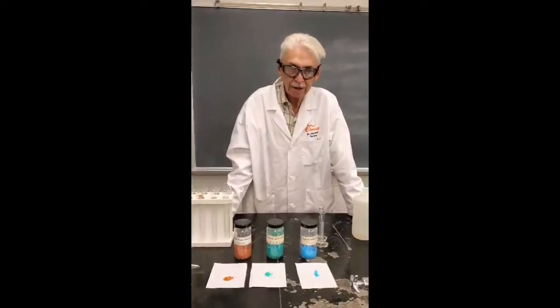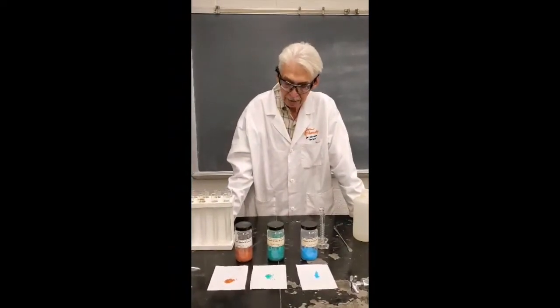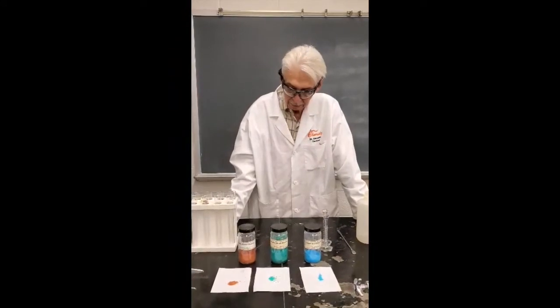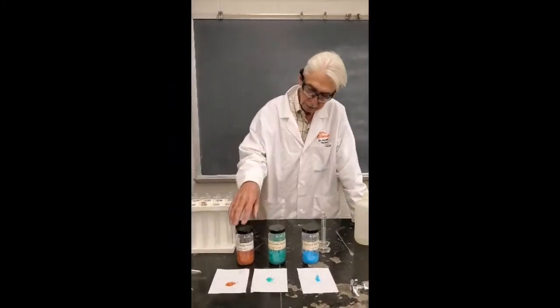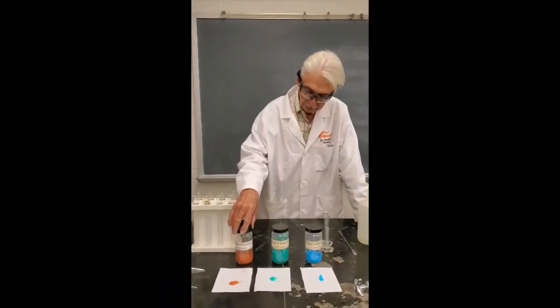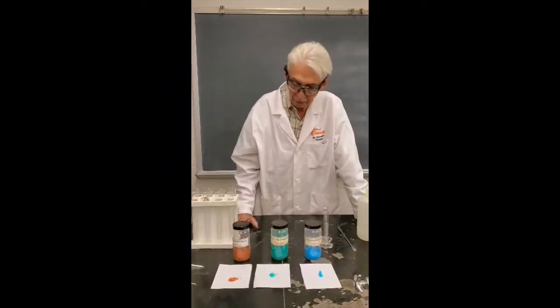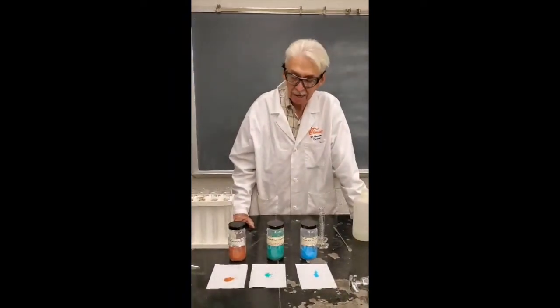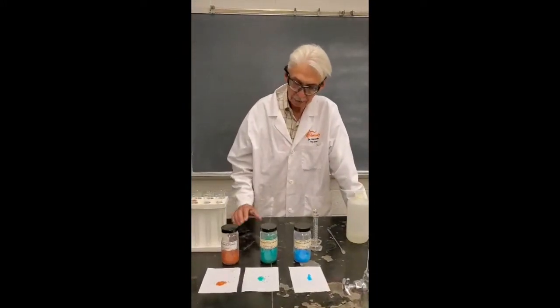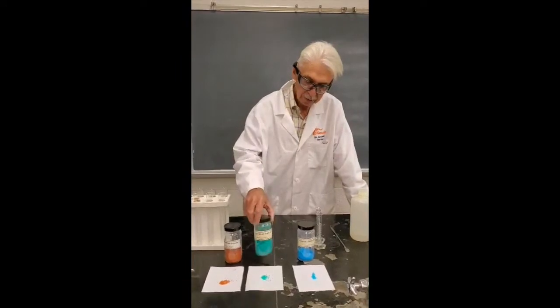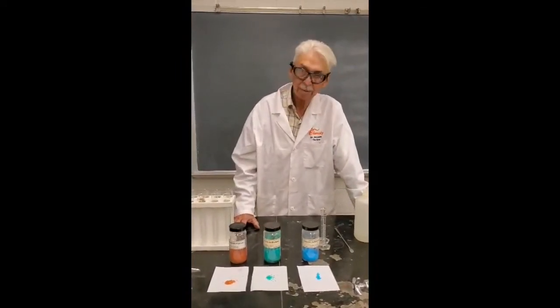These coordination compounds have a metal ion, like most common ones are plus two and plus three. These ones here are all plus two metal ions. This one is the cobalt-2 nitrate. It says hexahydrate. That means there's six water molecules and they're actually attached to the metal ion in an octahedral fashion. As you see in the experiment, you'll see a structure of it. And this one is nickel-2 nitrate. It's also the plus two state. It's got six water molecules attached.